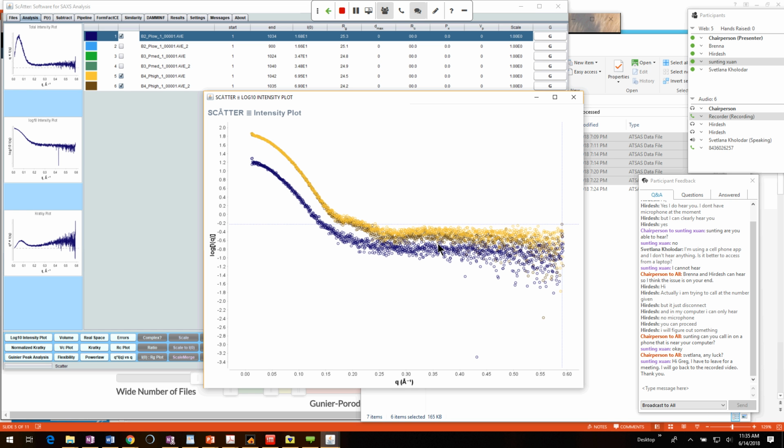I have a lot of deviation in the Guinier region for my average data in the first couple of frames, really a lot, because my sample is so sensitive. I think I was not doing the right thing. I was taking the first 2 frames for the Guinier region and then all the frames for the other regions, and there was a discontinuity. But I guess it's important to keep this Guinier continuity, right?